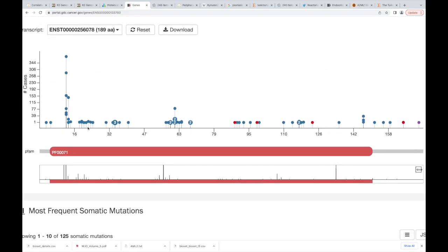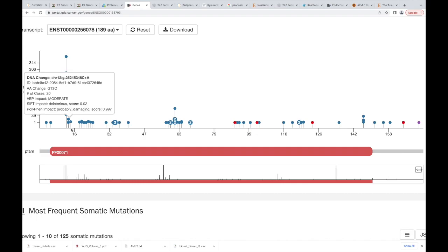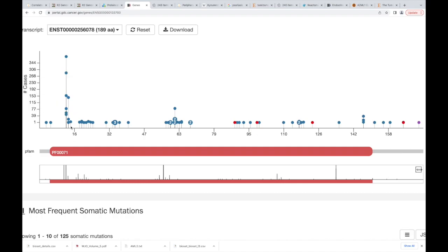And let's look at their mutation pattern. A little different now, isn't it? Now we can start seeing these big sites of mutation. You're probably going to mutate it right at the beginning of the gene if you want to affect its function. This is probably a binding site, and what this is allowing you to do is see probably the active sites that you should pay attention to.